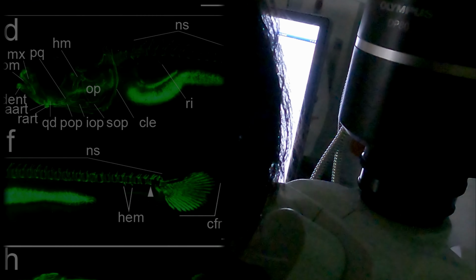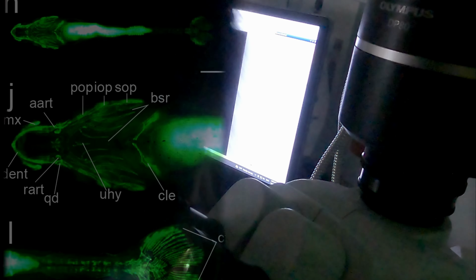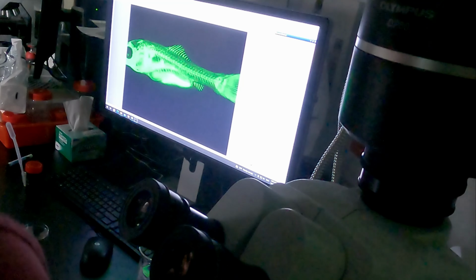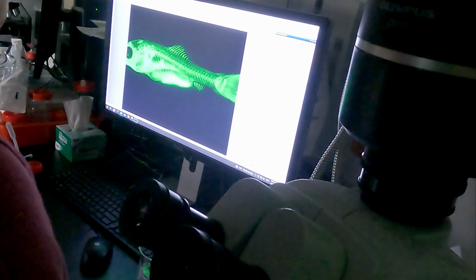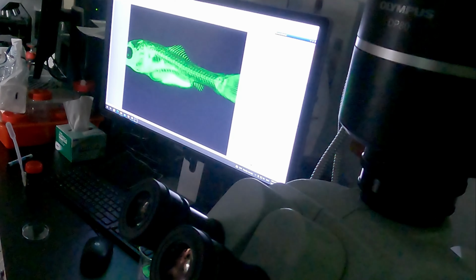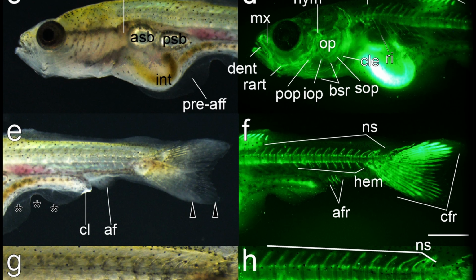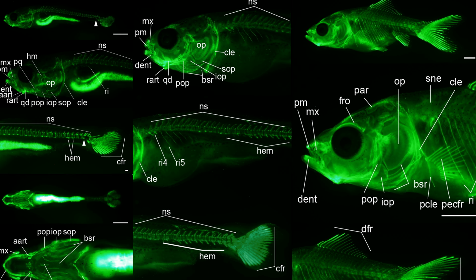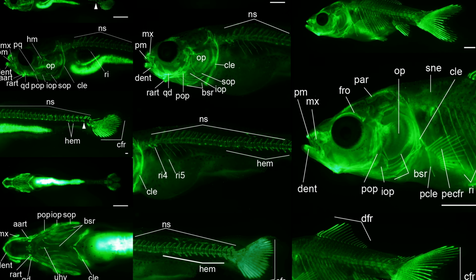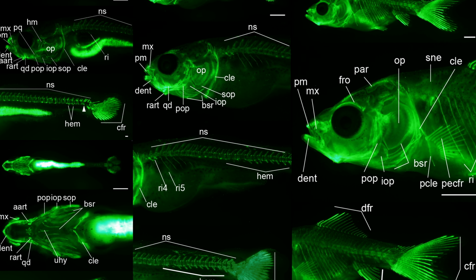This makes it possible to clearly observe fin rays and other skeletal structures that are difficult to see under normal light. Most importantly, there is no need to put the fish in a fixative or perform the process of making transparent specimens. Thus, we can continue to observe the same individuals. By taking clear photographs, we can determine the timing of the appearance of various skeletal structures.